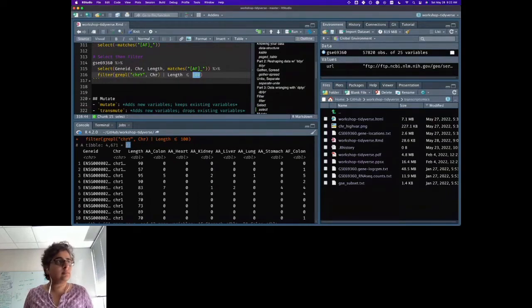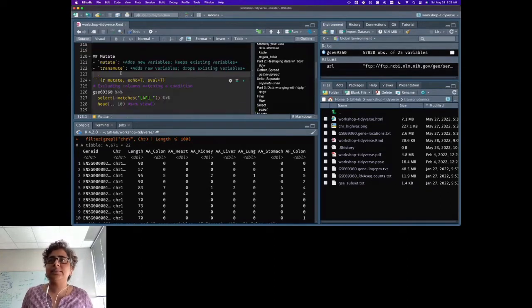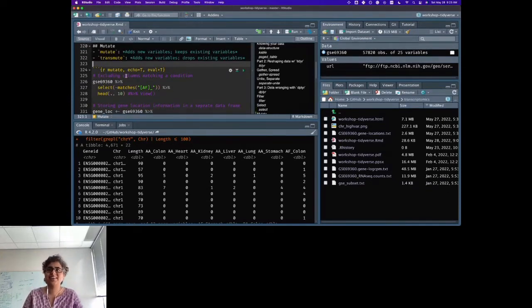Okay. I still see mostly green. Yeah, everything good. Okay. Yeah, nothing in the Google Doc or the Slack. Yeah. Okay. So then we are going to mutate.